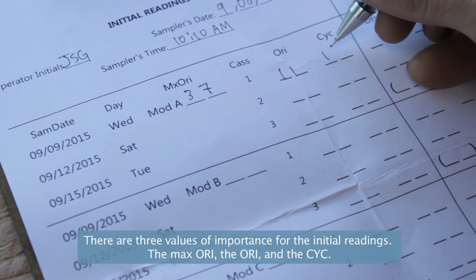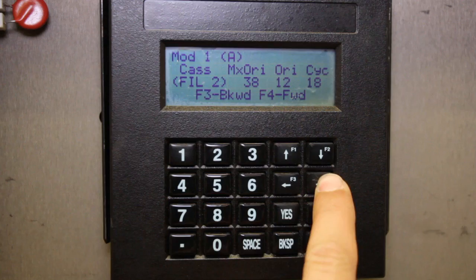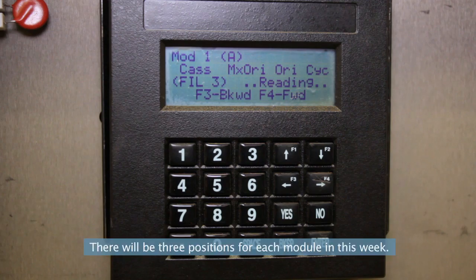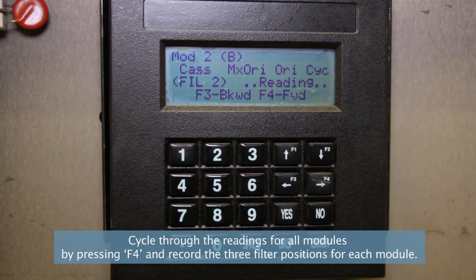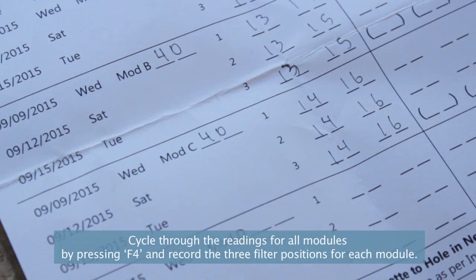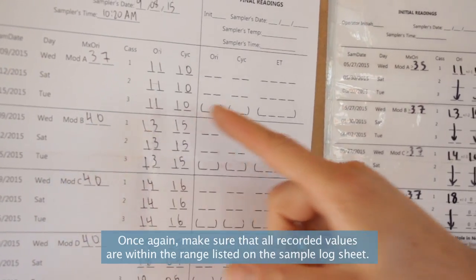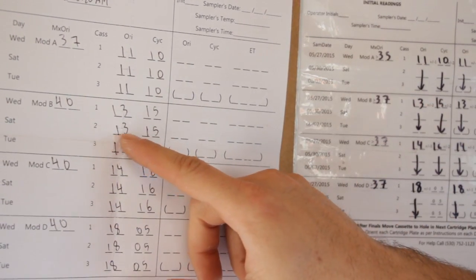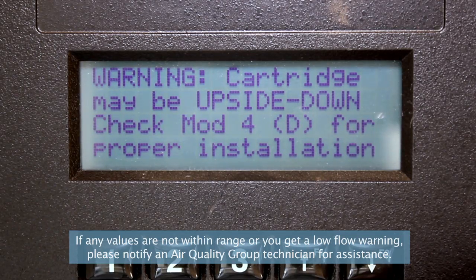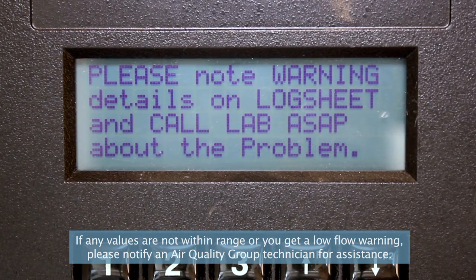There are 3 values of importance for the initial readings: the max ORI, the ORI, and the CYC. There will be 3 positions for each module in this week. Cycle through the readings for all modules by pressing F4 and record the 3 filter positions for each module. Once again, make sure that all recorded values are within the range listed on the sample log sheet. If any values are not within range, or you get a low flow warning, please notify an air quality group technician for assistance.